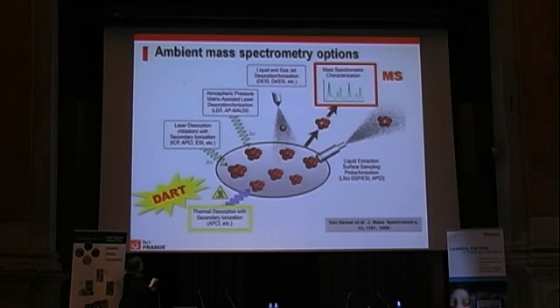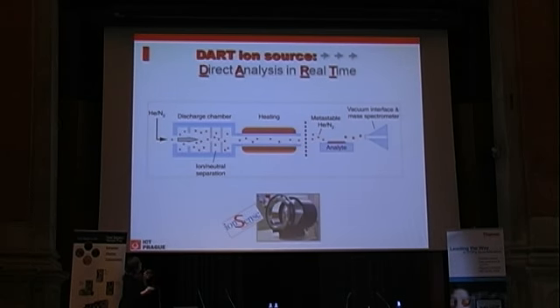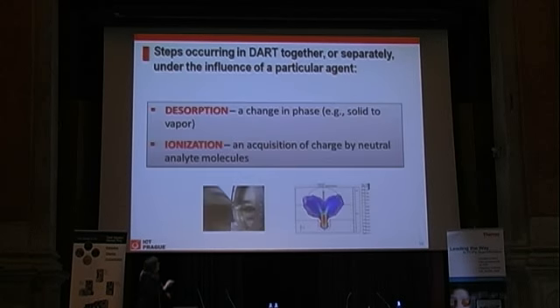This is in ambient atmosphere. It is interacting with helium excited atoms, and here is the entrance into the mass spectrometer. So it is in open space, contrary to MALDI, for example. Well, the principle, in brief, is desorption. So your analyte has to be thermodesorbed, and of course you have to have some ions, and that's all.